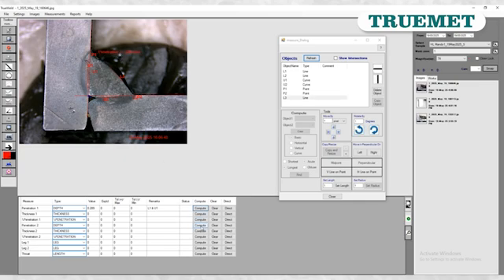Similarly, going to measure the penetration 2, that is L2 to U2. This is my penetration 2 distance. For thickness measurement, I am using a direct tool from here and going to measure the thickness directly, like here. This is my thickness 1.